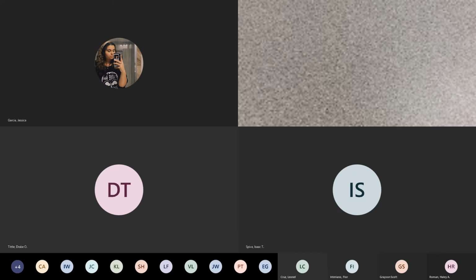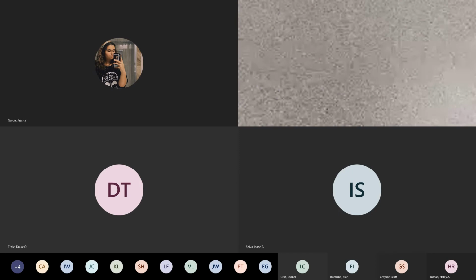So what I'm going to do is I want you to write these down at home for each sample. And at the end of this lab, after we test them all, I'm going to go over what I have for my answers, and we're going to compare them to yours. Now, next week when we do a lab, I'm going to do the same thing, except you're going to then use that data to use the flow charts in your lab book to try to determine the names.